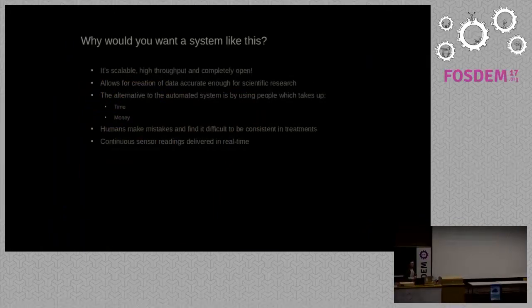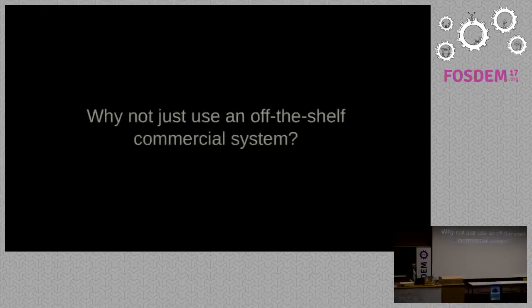And I think the big question is, why would you want a system like this? If you want to keep plants alive is the big thing. If you wanted to do any sort of research on plants and create data which is very accurate, and you don't want to stand there 24/7 recording things by hand. Also, you want an automated system because people make mistakes. So do computers, but they make slightly fewer mistakes, I would hope. And also, you don't want to be there at 3 in the morning writing down plant readings.